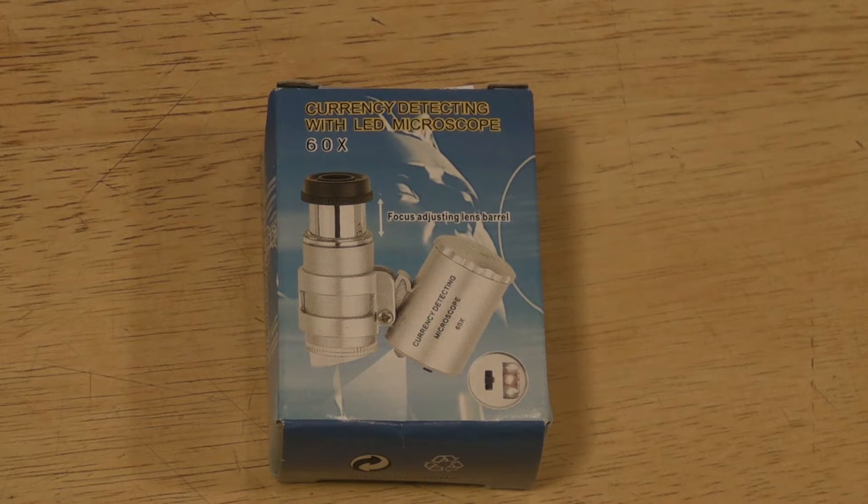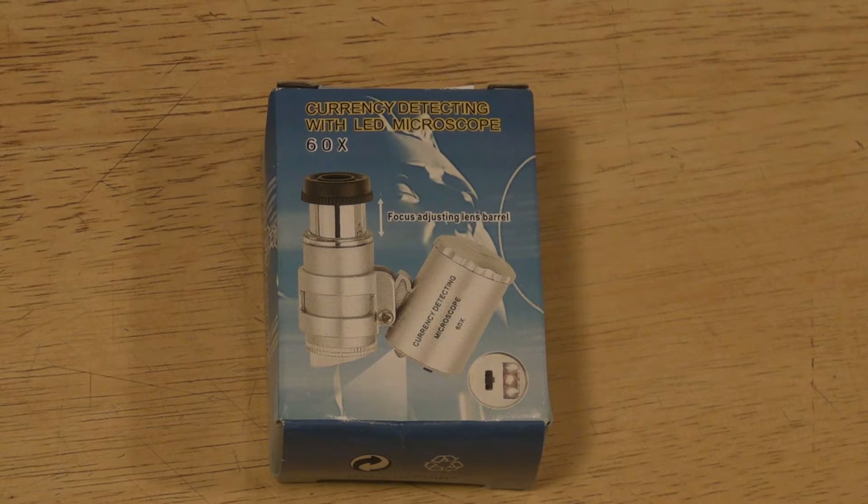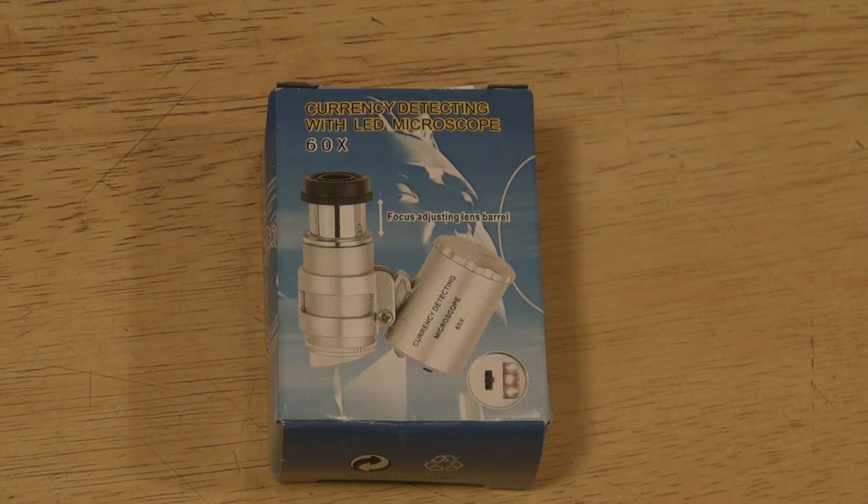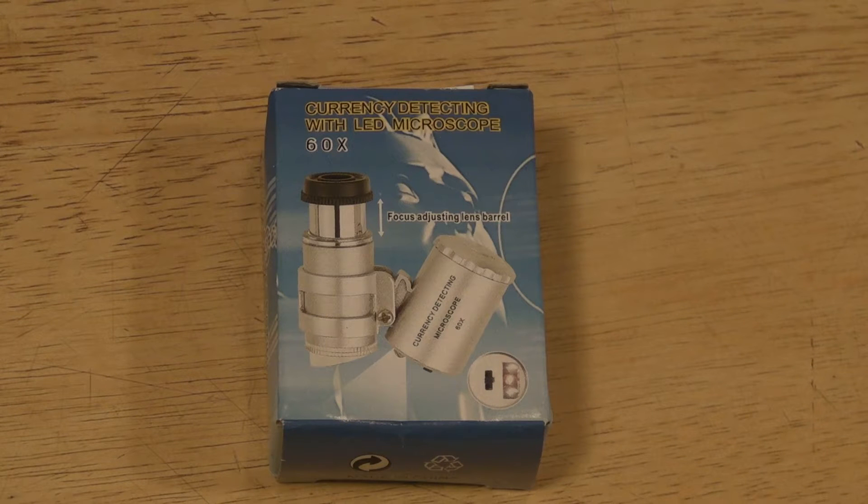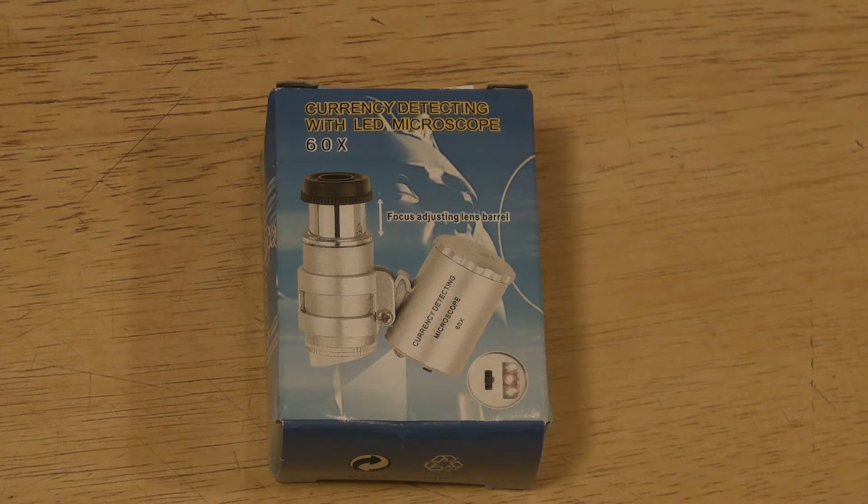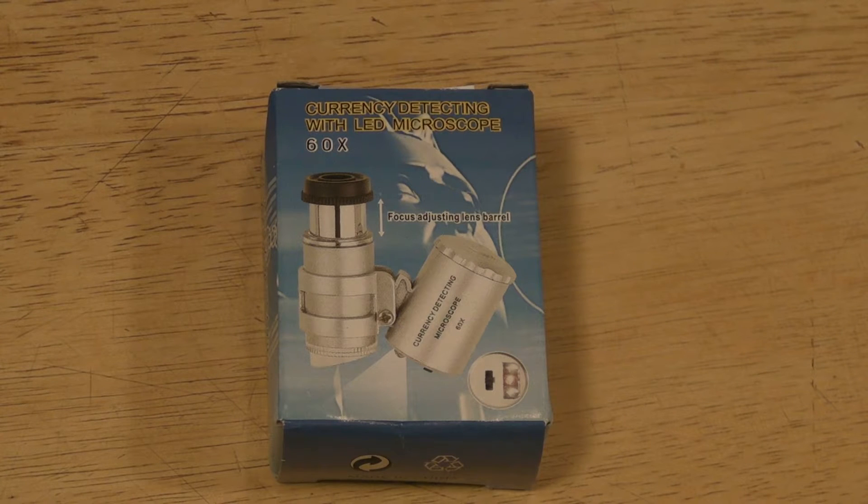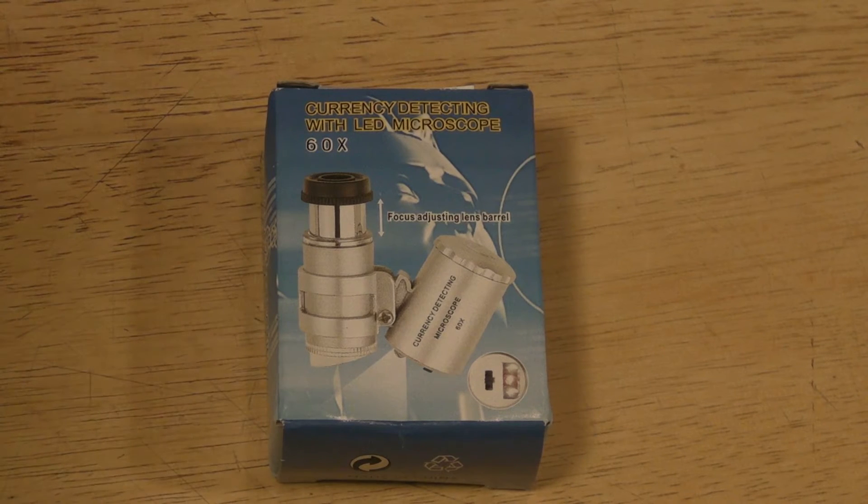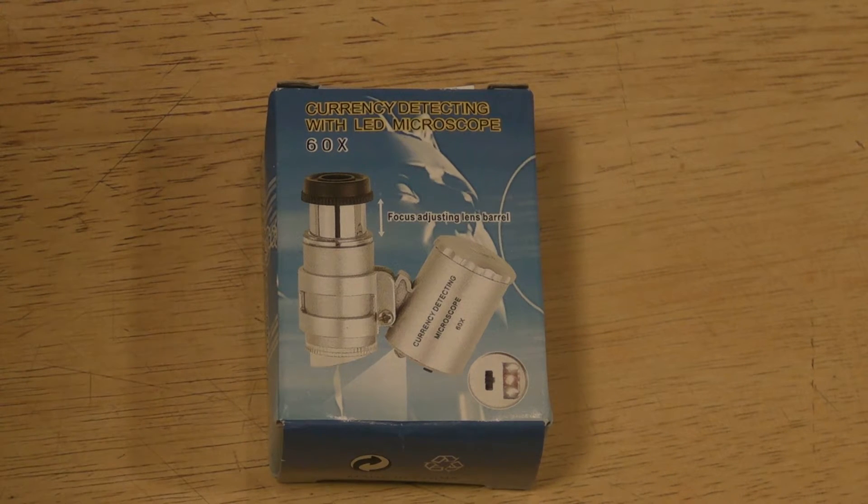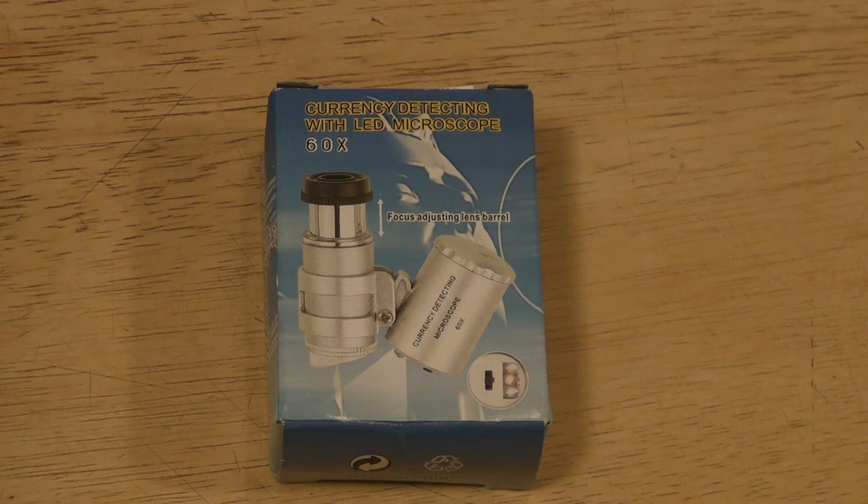So this is a Chinese product that's actually shipped from China on Amazon. But the thing that makes this product intriguing if it's something you could use is it's only $2.75 free shipping, and that's a pretty good deal I think.